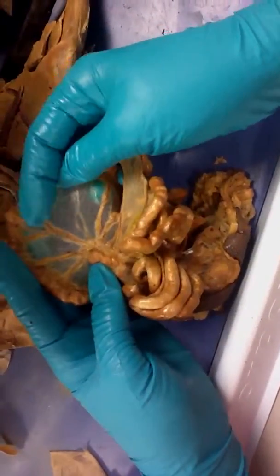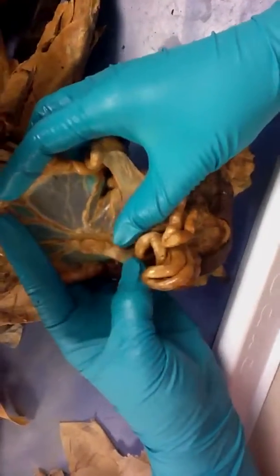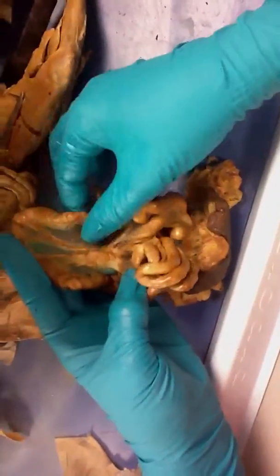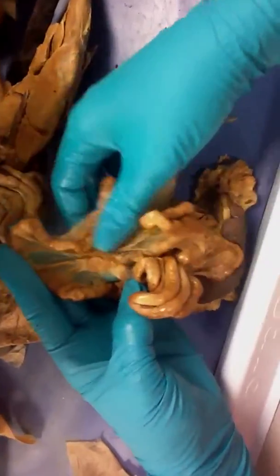And then we also have lymph ducts. You can't see that, it didn't inject, but right here is a lymph node. And so any issues here, they're going to drain. Lymph nodes are an area where all of the lymph in a certain spot will drain to. Okay, so all the lymph is going to drain to this lymph node here.